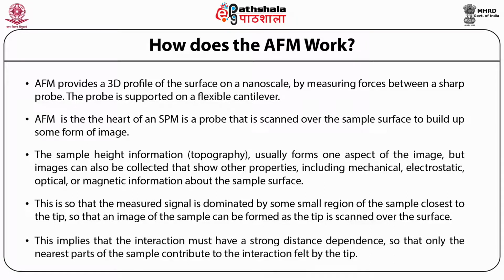This implies that the interaction must have a strong distance dependence, so that only the nearest parts of the sample contribute to the interaction felt by the tip.